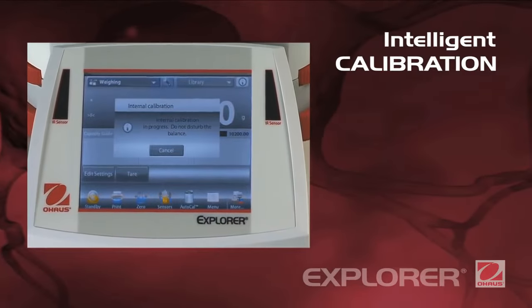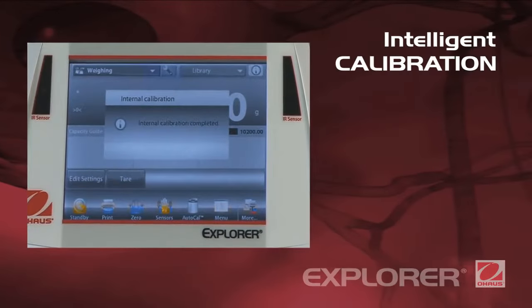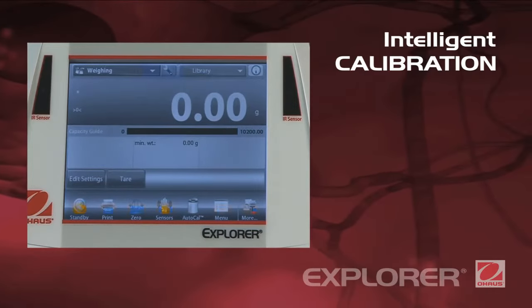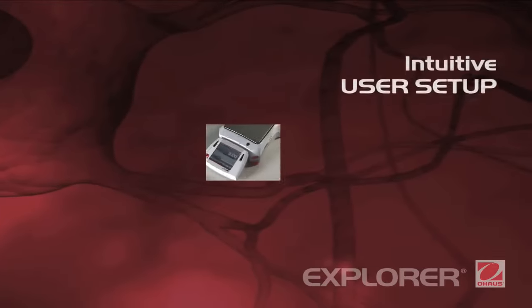Intelligent calibration. Auto-Cal ensures performance and assists with routine maintenance by automatically calibrating the balance daily. Calibration is made simple and no weights are required.